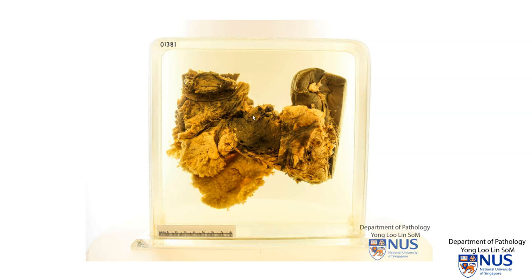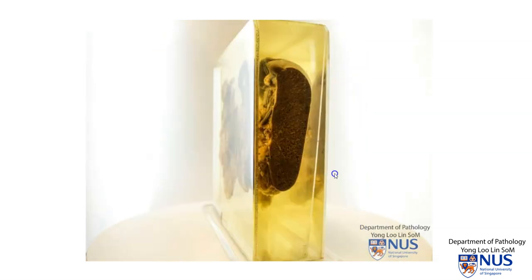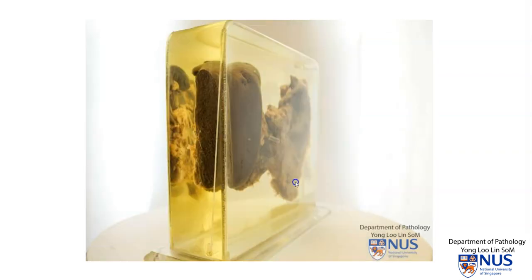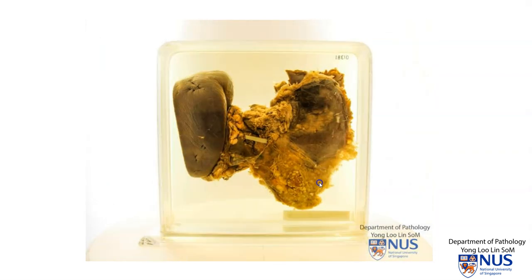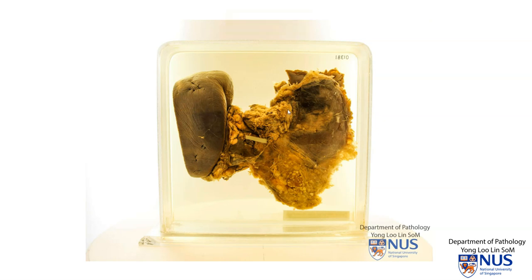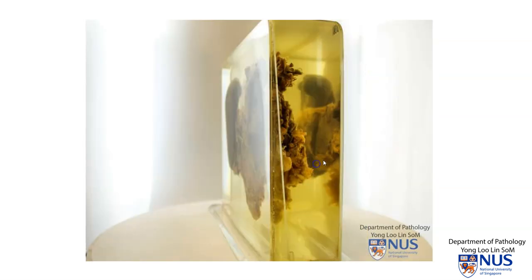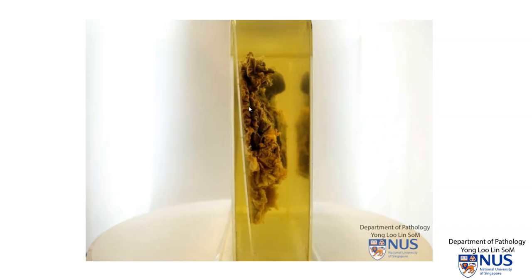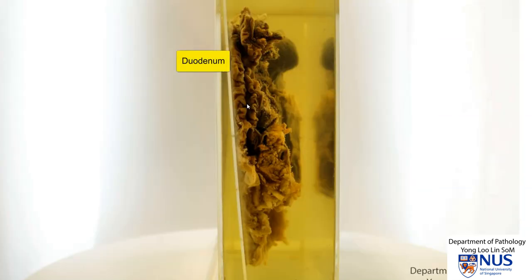Hello, we're looking at a gross specimen that comprises part of the stomach and duodenum, the pancreas, the omentum, and the spleen. It's actually easier to orientate when we turn this specimen around. Now we're looking from the posterior surface. This on the left is the spleen, and this is the pancreas. This is part of the stomach, and this is the omentum. On this surface, we can actually appreciate the duodenal mucosa.